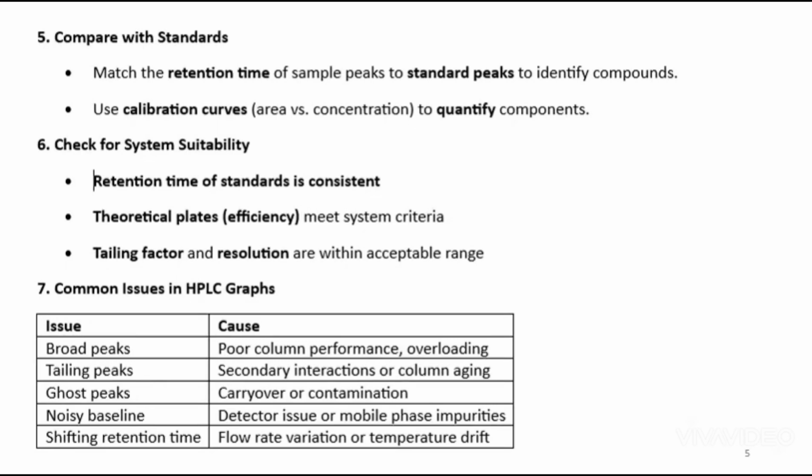Now compare with the standard. Match the retention time of sample peaks to standard peaks to identify the compound. That means the standard material will have some retention time, and you match the retention time to the standard peak.